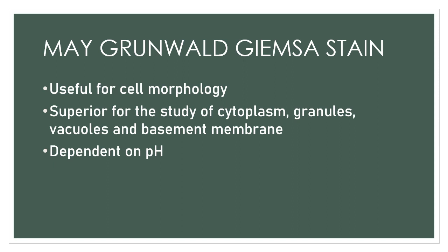Okay, and so you have your May Grunwald stain. This one is used for studying cell morphology in air-dried smears.